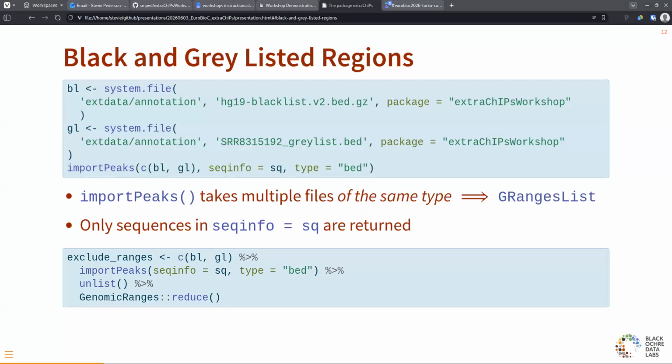That's something to do only for regions of the genome that you don't trust. Regions that you don't trust, or do you also include, for example, let's say you don't think transposable elements should be there, and you want to mask them as well? Yeah, or repeats in general? Yeah, no, that's an excellent point. I have assumed that they're in the blacklists. I haven't checked that. Often those regions are really hard to align to anyway. But yeah, you could mask any transposable element you want, as long as you're comfortable you've accurately defined a transposable element. They're fun little beasts. Yeah, so you can mask anything you want.